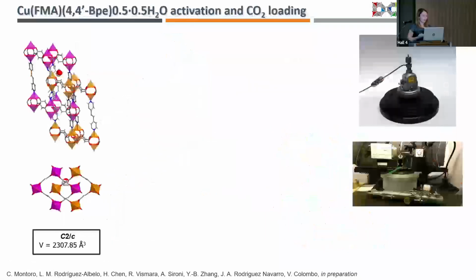So we try to deal with this question with laboratory-scale instrumentation. We have a very simple system. It is a goniometer head that can be mounted both on single crystal and on powder X-ray diffraction instrumentation with a capillary that is invisible in this slide, but is there, believe me. And we can activate the sample in situ. We can load the gas pressure up to 50 bar. And we can measure our diffraction on, in this case, a single crystal.